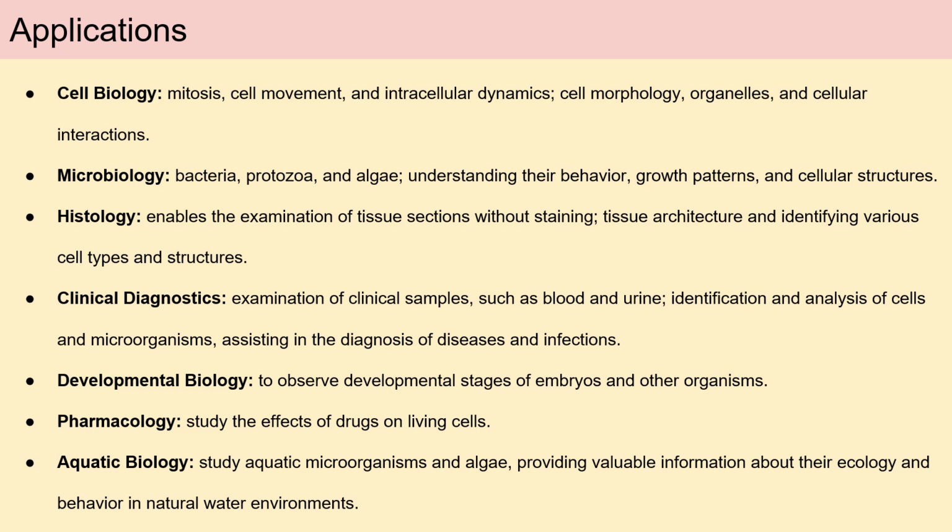In histology, it facilitates the examination of tissue sections without staining, aiding in the study of tissue architecture and the identification of various cell types and structures. The technique is also valuable in clinical diagnostics, where it is used to analyze clinical samples, such as blood and urine, assisting in the identification of cells and microorganisms for disease and infection diagnosis.